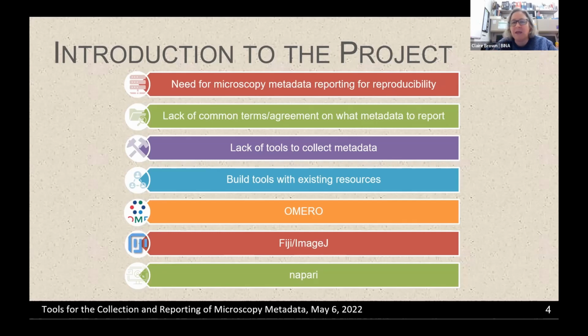So we have a slide at the end showing all the different groups that have contributed, but Caterina had mentioned earlier, she started this project with the 4D Nucleome, and Bioimaging North America and QUAREP and many other groups have been involved in really spending a lot of time having conversations and just making sure we agree on the terms and agree on what's the essential information that needs to be reported. And for any of us working in a lab or in a facility, you know how difficult it can be to convince people to collect that information.